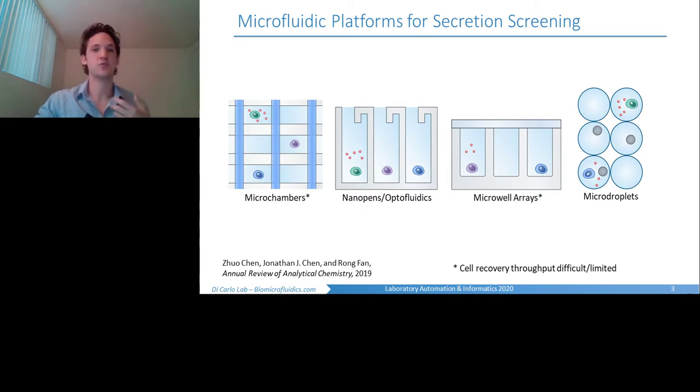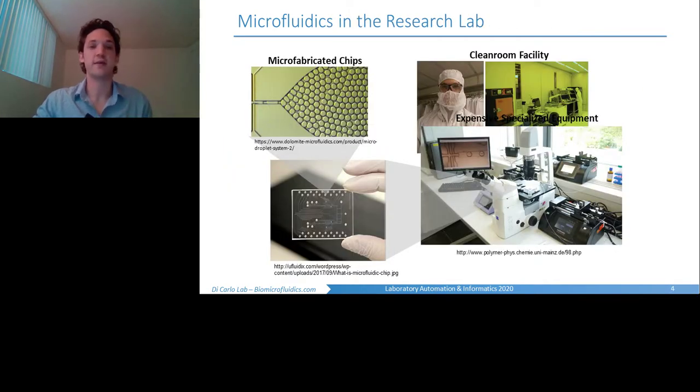Now, say you want to use some of these microfluidic platforms to do single cell secretion assays, whether it be in your lab or as a research project or as part of a company. Working in a microfluidics lab, you see how a lot of these things actually work firsthand. For example, you might see a paper where you have a nice clean microscope image of a microfluidic device that fabricates droplets. It looks really simple and straightforward and seems really easy to use.